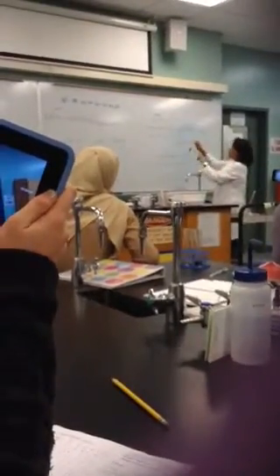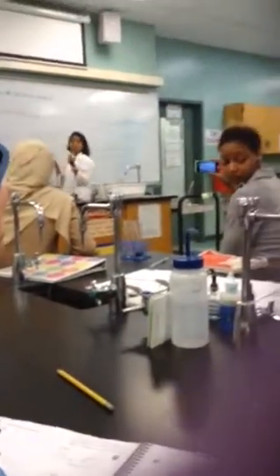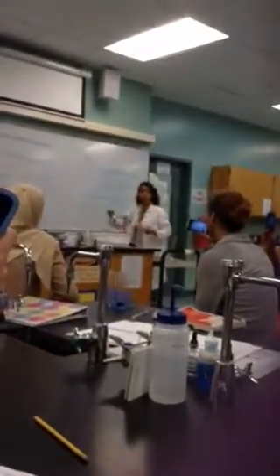However, this precipitate is because it probably recognized the end ones, so it usually comes a little precipitate. It's just not as strong as number 4. Also, we don't know how old the starch is, so it could already be broken down a little bit. There could be some molecules of glucose floating around that just got broken out by shearing, from pumping it around.